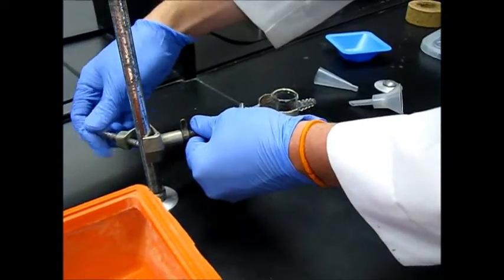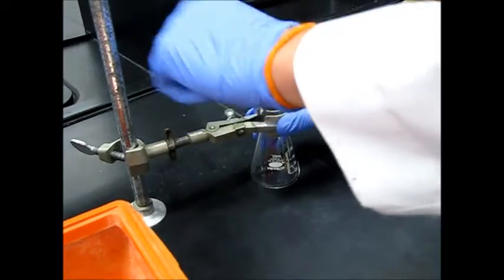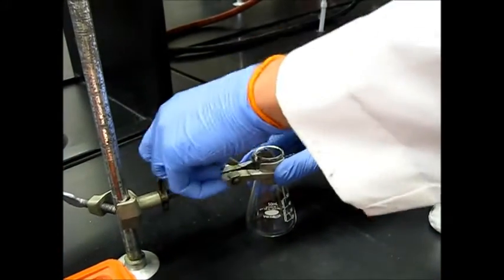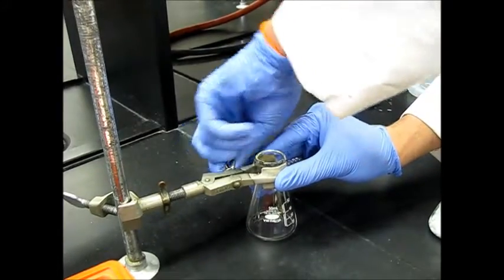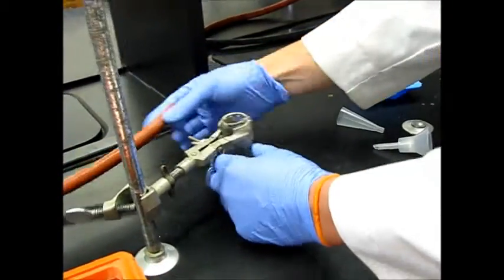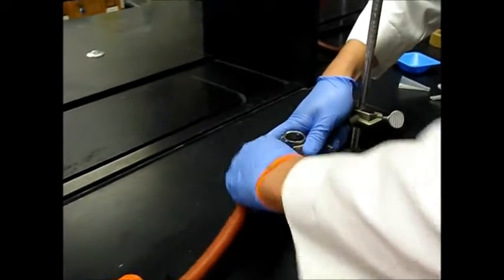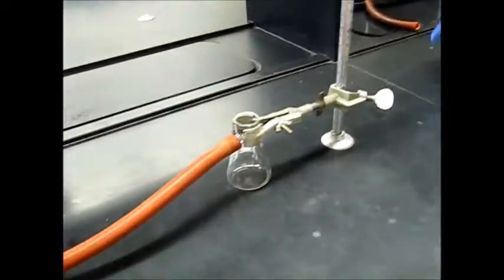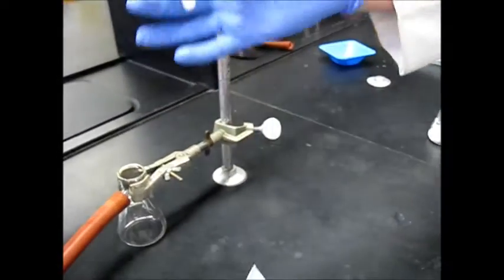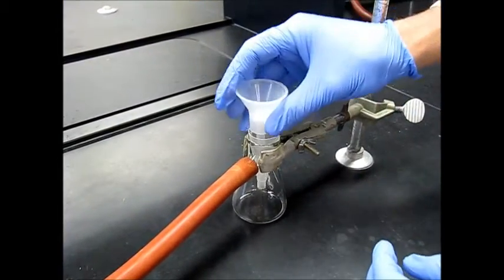Next, what we need to do is set up this vacuum filtration. So we'll lower our clamp down. We're going to go ahead and attach our vacuum. We're going to spin it around and attach our vacuum right here. Cool. So the vacuum filtration that we're going to be using is a Hirsch funnel. So this is called a Hirsch funnel adapter. It's just to make sure that we get a good seal into this Erlenmeyer flask. So we'll go just like that.